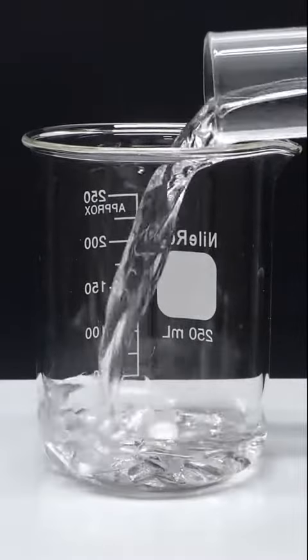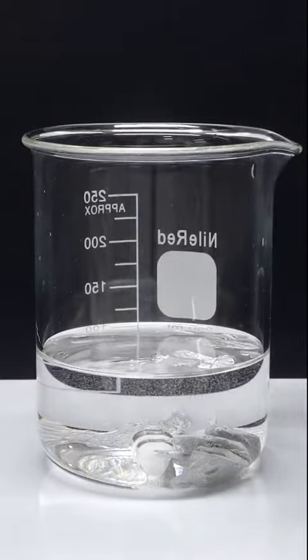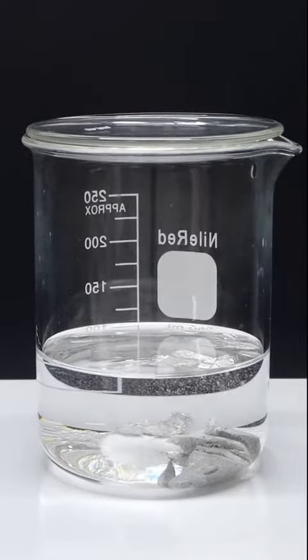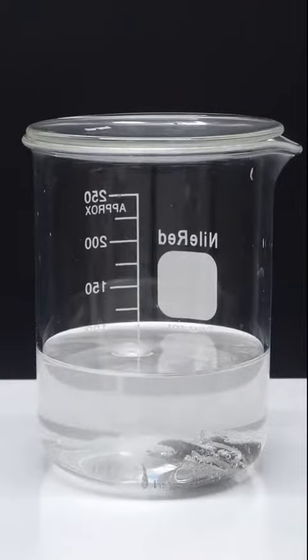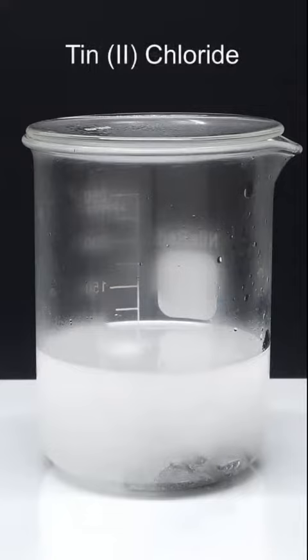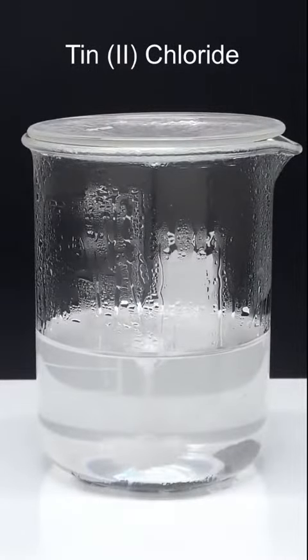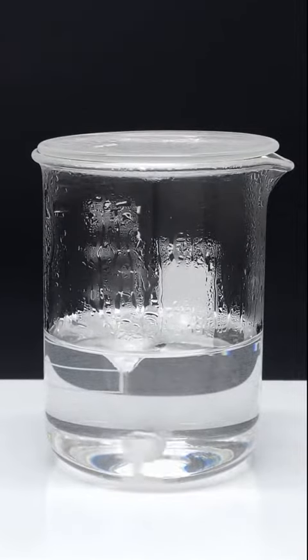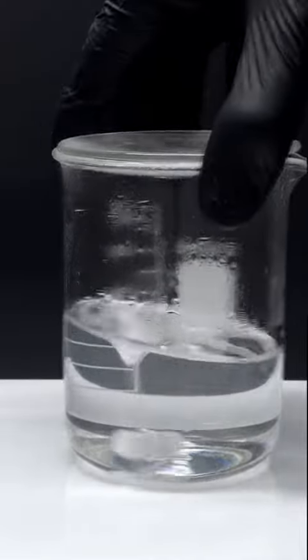On top of this, I'll add some concentrated hydrochloric acid, and I'll turn on the hot plate. Over the next 24 hours, the tin slowly disappeared. It was all turning into tin(II) chloride, and at some point, I added some extra acid. When pretty much all the metal was gone, I felt that it was done.